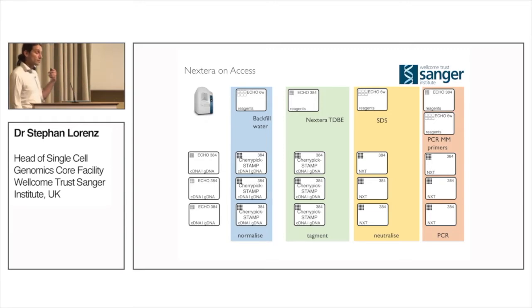So the situation we're now working on with Labcyte, and I don't know if this is part of your Labcyte 2.0 to 3.0 transition, or if it's 1.9 to 2. What we want is a process that basically runs one plate through all steps before it pulls in the next plate. We've now started to work on this with Labcyte, so we'll see how this goes.